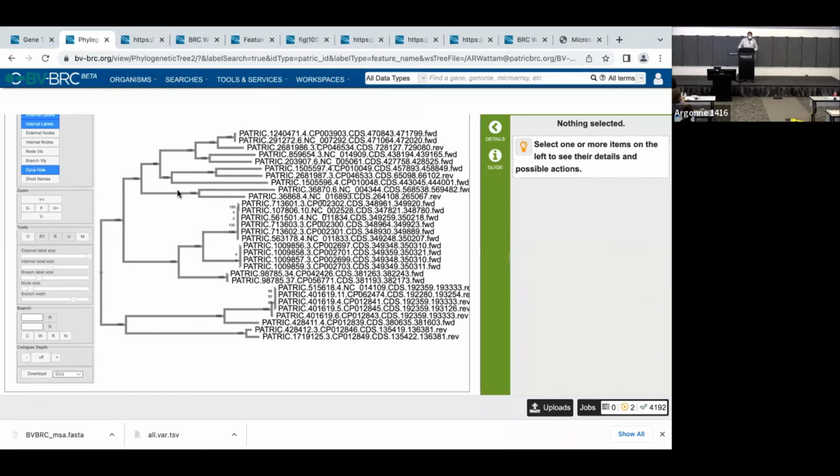If you want to know the relationships among copies of a gene, which could include duplications within species, and you could be interested in tracking horizontal transfer, you might want to compare the topology of the gene tree to the species tree that you've built for the same exact genomes.